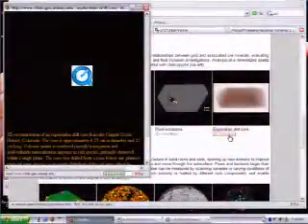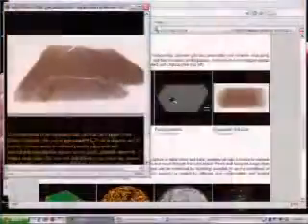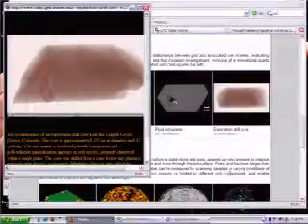These are meteorites, for example, here, in which the important thing was the vesicles that are located inside of them. This is a drill core from the bottom of an open pit gold mine in Colorado. They were not sure whether there were further gold samples there, so they took a core.